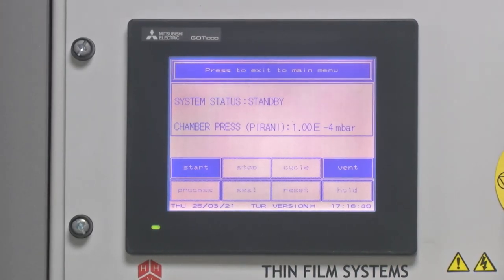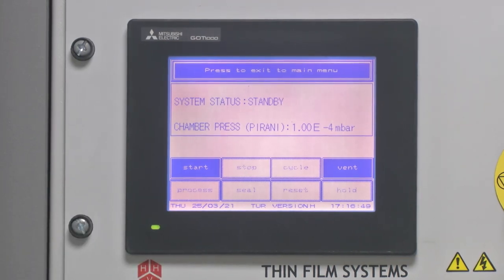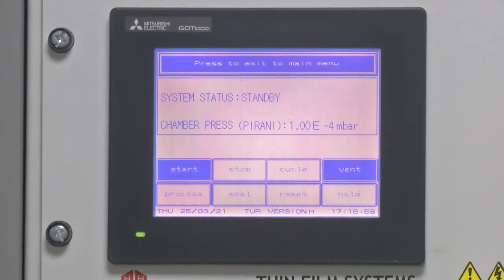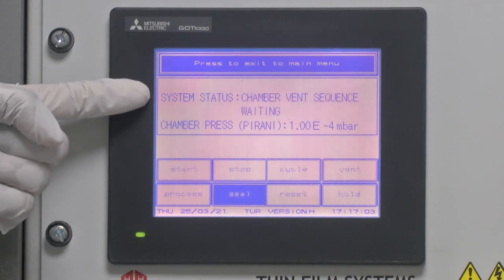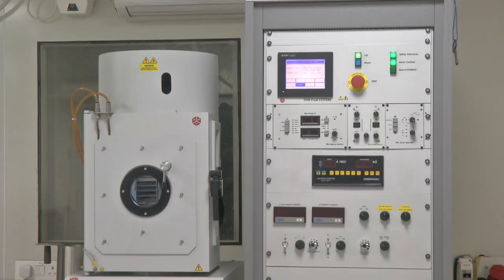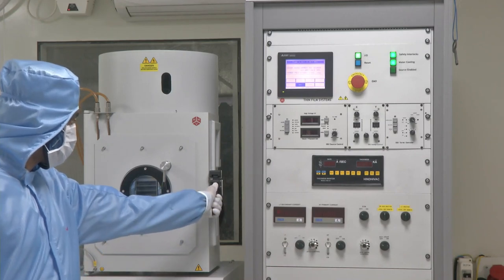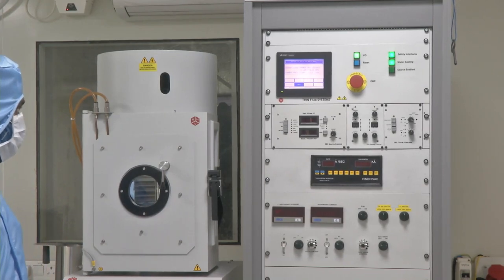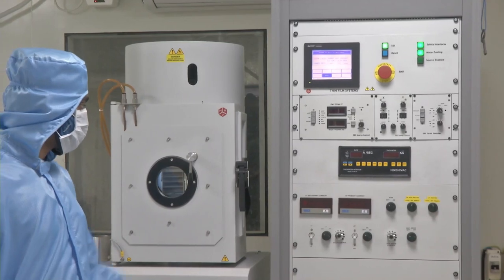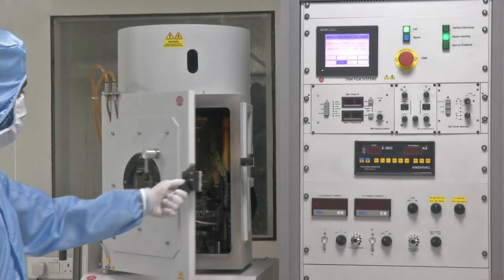The system status changes from 'turbomolecular pump down' to 'standby.' Once it reaches standby, both the vent and start buttons are activated. Since our deposition process is done, we click vent chamber. As soon as we press vent, the vent sequence starts and the air admit valve — which releases the vacuum — is opened. This process typically takes 10 to 15 seconds. Once the chamber is at the same pressure as the atmosphere, the chamber can be opened.